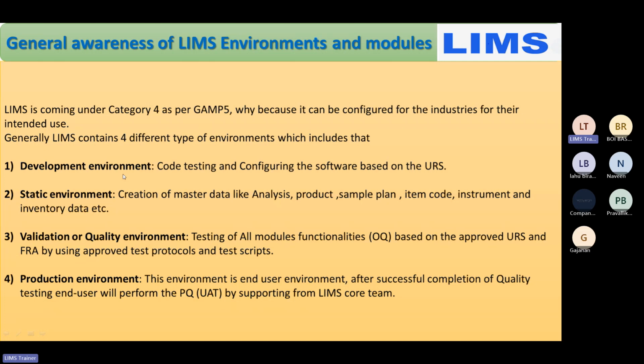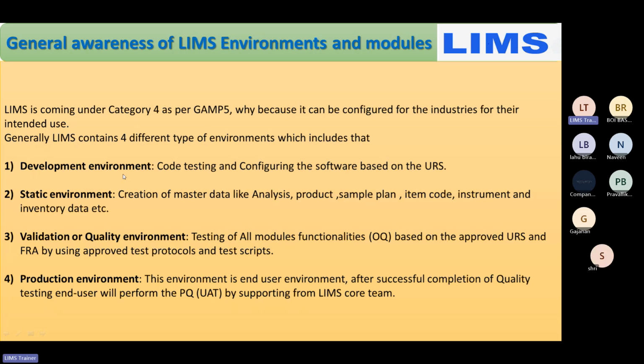And here come the different job roles available in the market related to LIMS software. In which particular environment you are getting the job or opportunity, you have to understand first; then only can you go into the details of that software. Some IT persons will have opportunities in the development environment. Pharma and end user persons will have opportunities in the static environment, because they are going to create the master data inside that software. They have to fill up the database, so that is how the brain of the software is created.